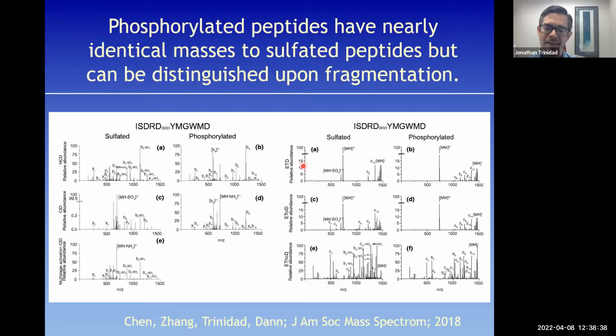modifications on the peptide. And so the take-home message of this slide, we don't have to look at every panel, but the phosphorylated version of this synthetic peptide has a fairly distinct MS2 pattern compared to the sulfated version of that peptide.